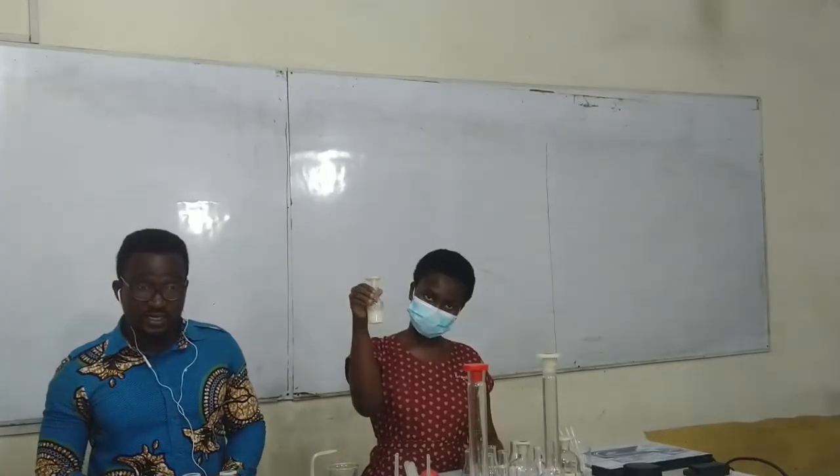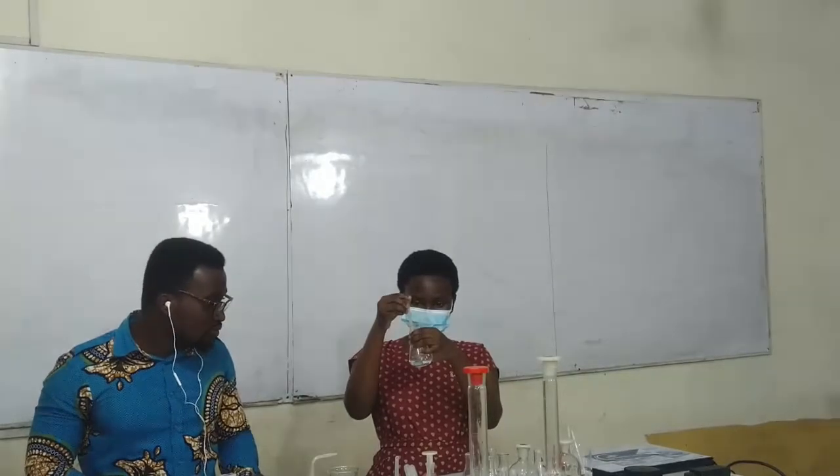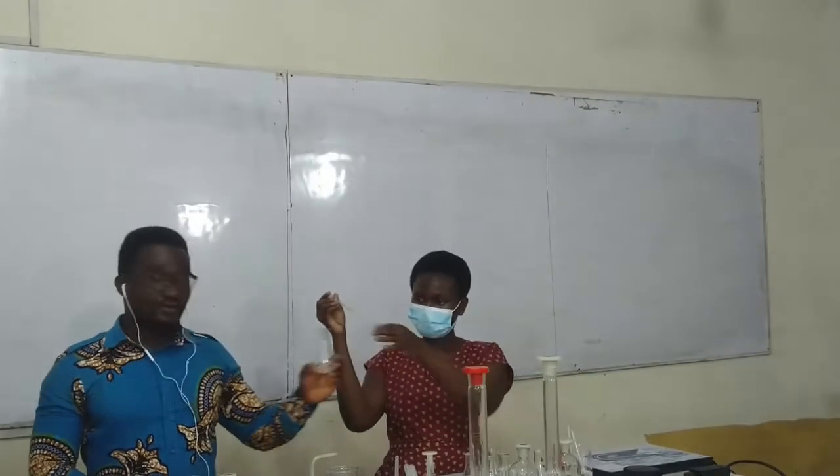Madam, pick the other solution. That is the same solution, solution A. This time, she's going to put some few drops of phenolphthalein so that we also know the nature of phenolphthalein in solution A, which will serve as a confirmatory kind of practical for us to know whether what we are doing is right. So the nature of phenolphthalein in solution A, 1, 2, 3. So she added 3 drops and then she swirls.